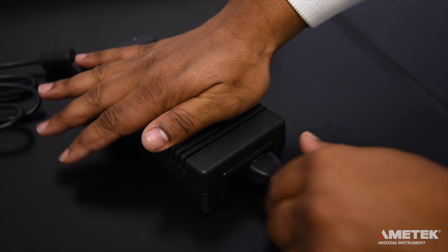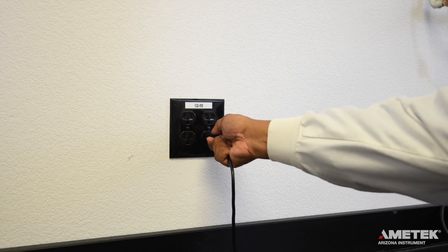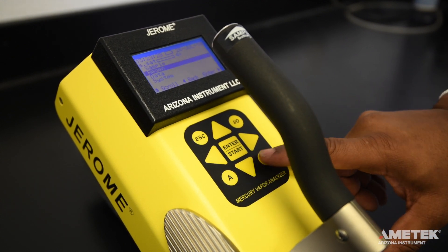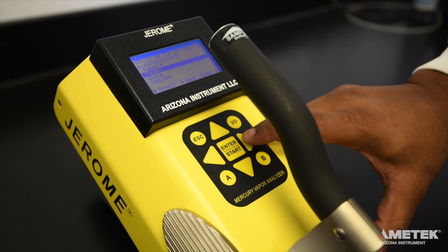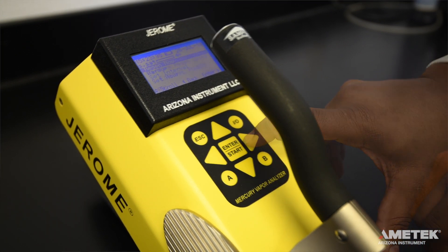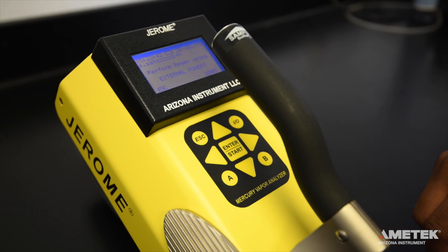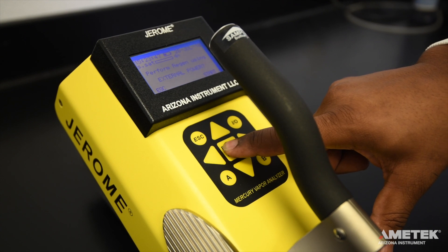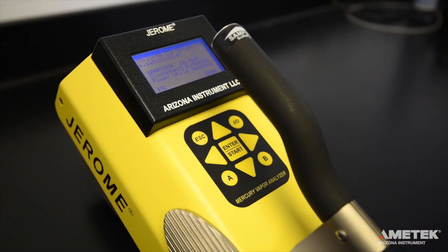To perform a regeneration cycle on the J405, plug the instrument into the line cord and AC adapter or the optional external battery pack. Press the right arrow button to enter the main menu, then press the down arrow button to move the cursor to Regen. Press the right arrow to select Regen Now on the Regen menu. When prompted to confirm your choice, press Enter to proceed or press Escape to cancel. Read the warning that appears, then press Enter to proceed or Escape to cancel.